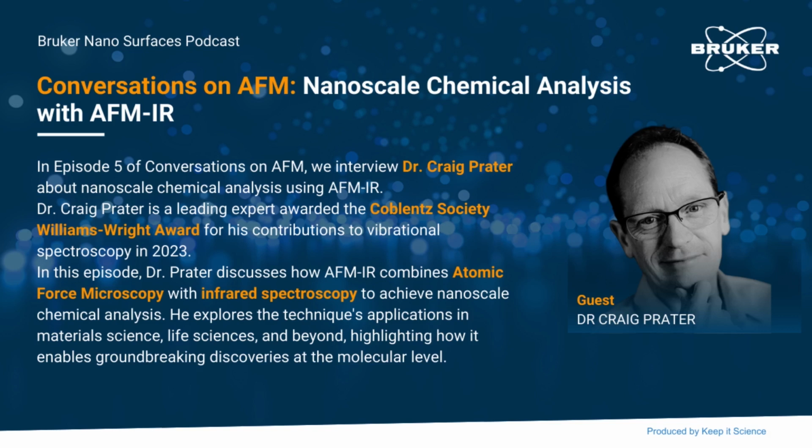So we can then use this technique to answer that previously unanswerable question of what is that. We can take an image with AFM, we can get this unique infrared chemical fingerprint, and then determine what the chemical composition is of the material under the AFM tip.